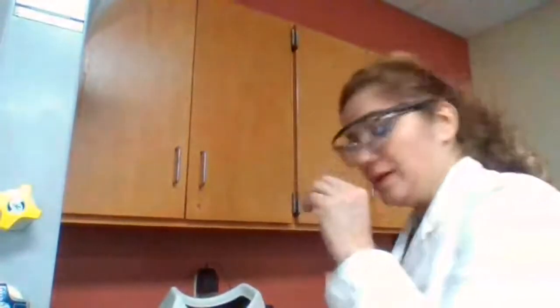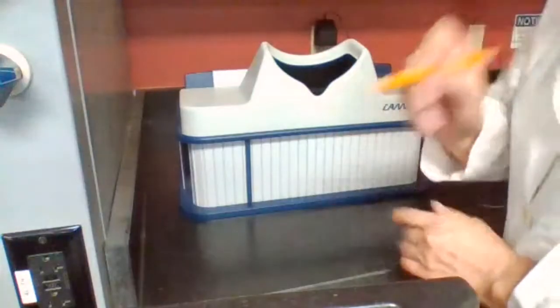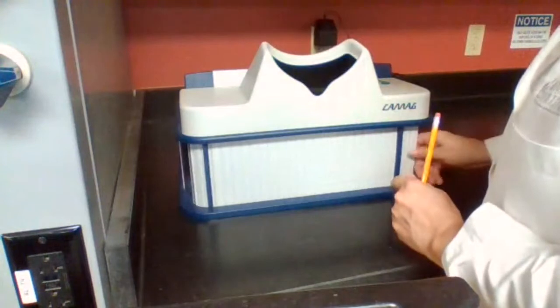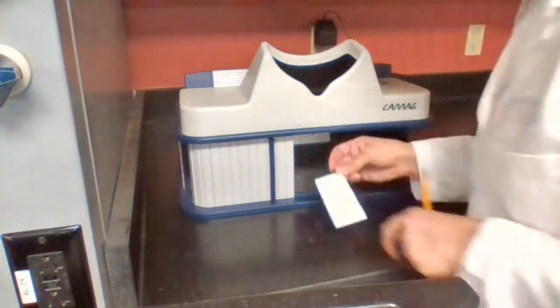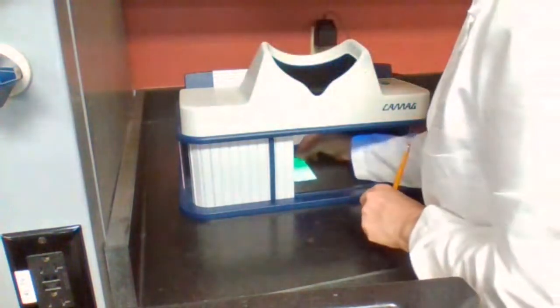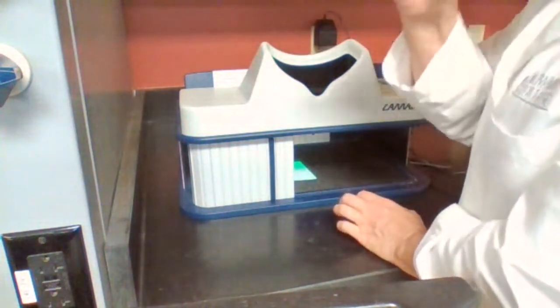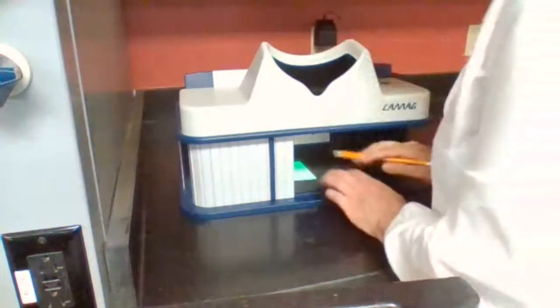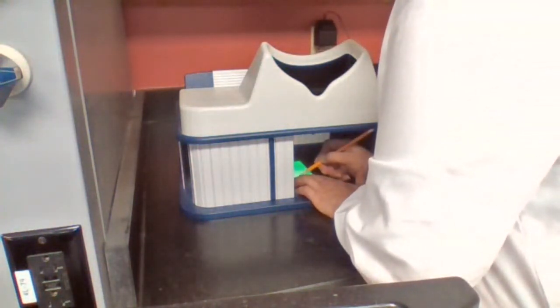What I'm going to have to do inside the UV, I have to take my pencil because when I take it out, it's not going to show the spots. See, when I take it out, I won't be able to see the spots. I have to leave it inside the UV. While it's inside the UV lamp, I'm taking my pencil and outlining the circles that show each of the samples, and it shows the solvent line, which we got already.